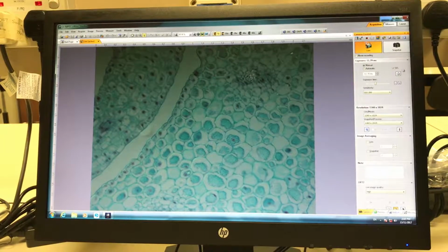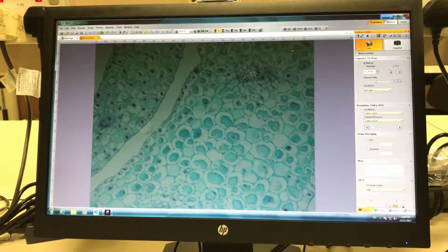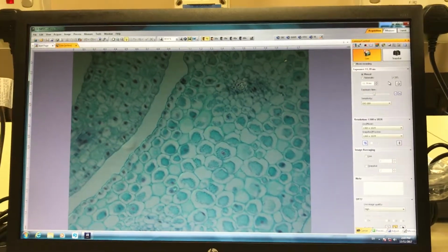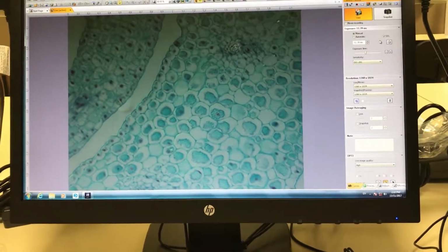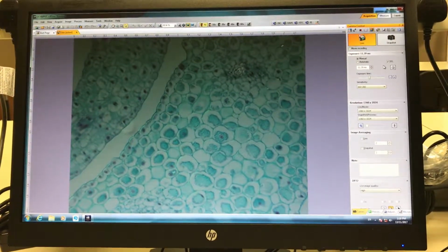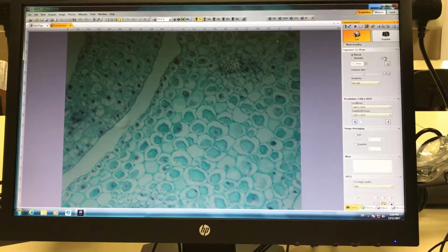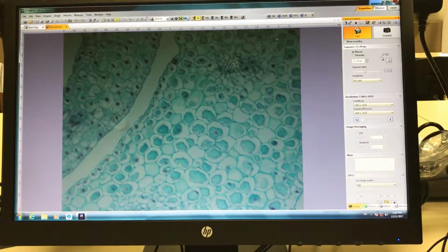SFL button. This is what we know as super fluorescence. The purpose is to protect the sensor chip from running into oversaturation. Because in dim samples or low light conditions, the exposure time tends to be very high, and it can subsequently cause the sensitivity of the camera to become lower and lower. So this feature is to protect the camera from this kind of situation. It will try to limit the exposure time to protect your sensor chip.